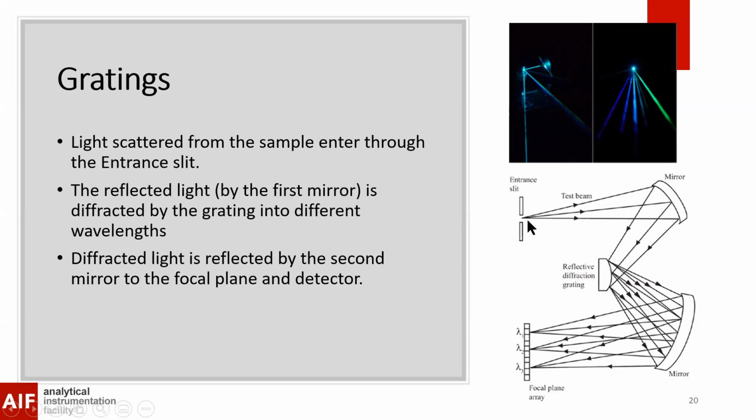As you can see, a mix of wavelengths comes through here, and eventually it gets to the focal plane and is separated by different wave numbers, number 1, 2, 3, and it keeps going on. And that's how we can differentiate what type of Raman shift we got.